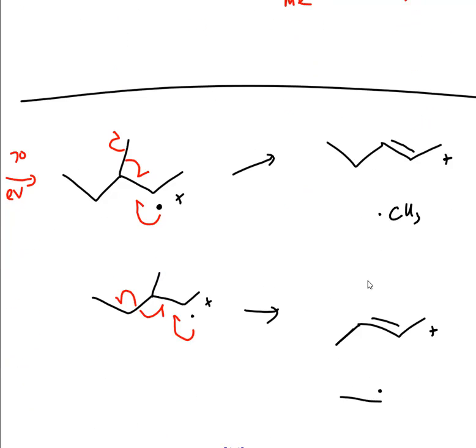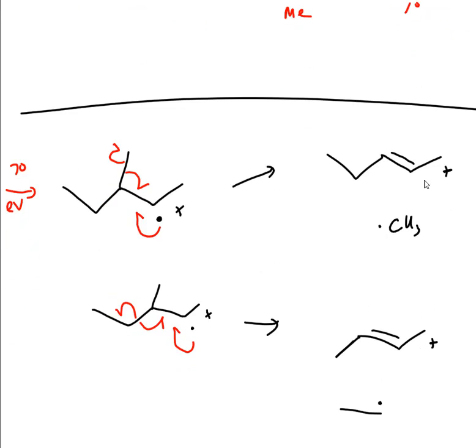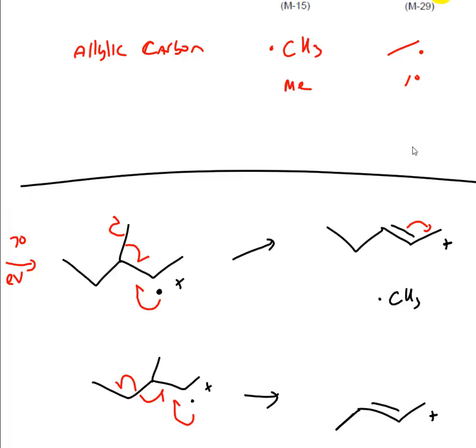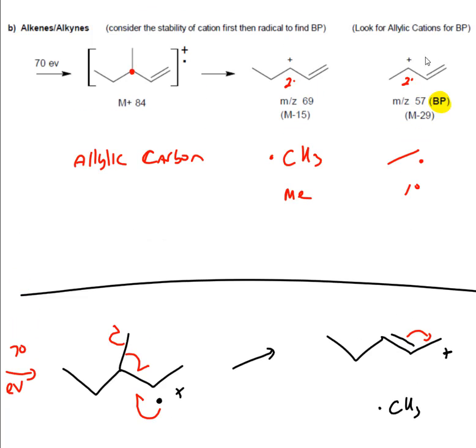Now you might say, wait a minute, you didn't get those two, because look, the double bond isn't on the end, right? See how they're on the end? Well, that's not a problem, right? This is just resonance. So from here, I can just show resonance, and then I'll have the double bond exactly as I show it up above. So if I just simply shift this over, now I'll have what's up above, that right there. And if I shift this one over, I'll have that right there.